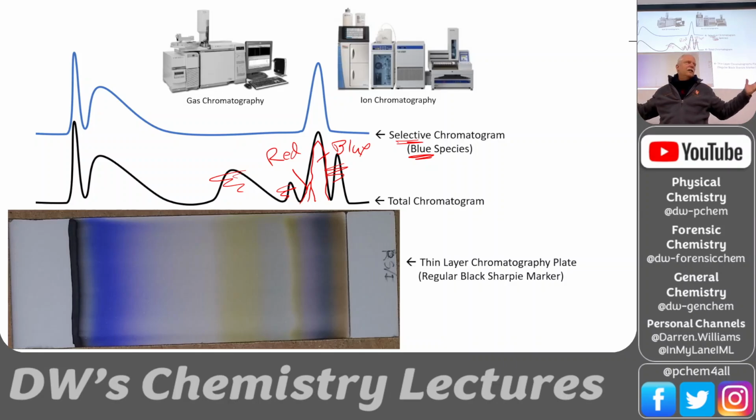The electrons hate each other. So when they're going through a wire, they're going along the outside of the wire, right? Why would they be in the middle of the wire? Because they'd be closer to the other electrons. So as they're flowing through a wire, they're all around the outside. Well, what else is around the outside? The helium or the hydrogen, the carrier gas.